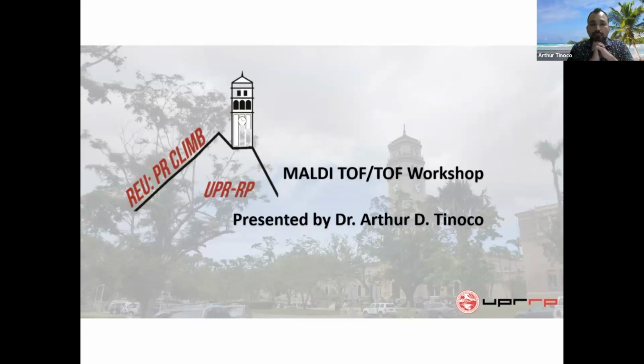All right, so the purpose of this workshop is to give you the background of a type of mass spectrometry, which I believe every one of you is familiar with, which is essentially measuring the mass of different chemical species. What I'm going to orient you on is the mass spectrometry that has to do with MALDI time of flight. The word MALDI stands for matrix-assisted laser desorption ionization.